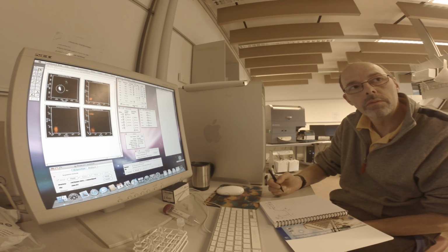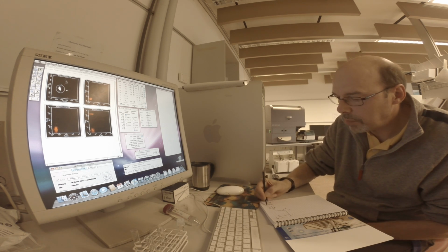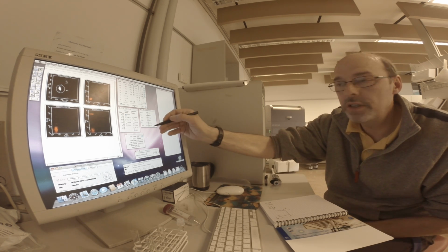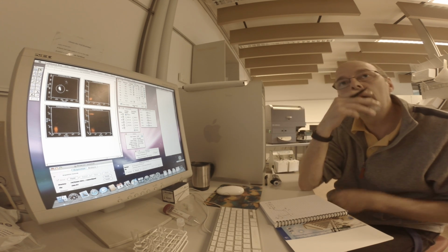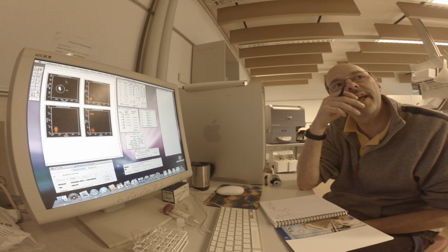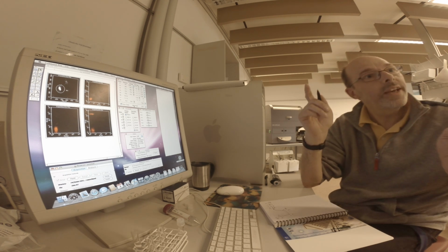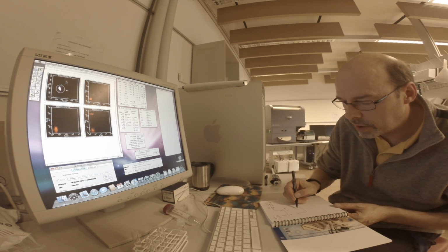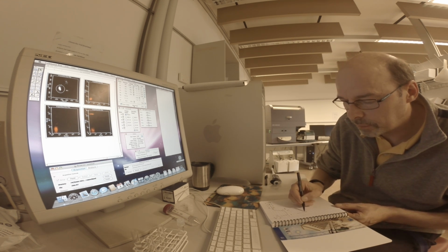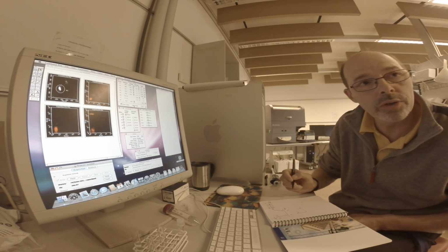Henrik and I have been playing a bit on Excel. And when you start playing with these where the compensation is just set to 0, they are 0, because it's minus 0. Because then when you start playing around, they will be lying up here and in here instead of where they supposedly should be.